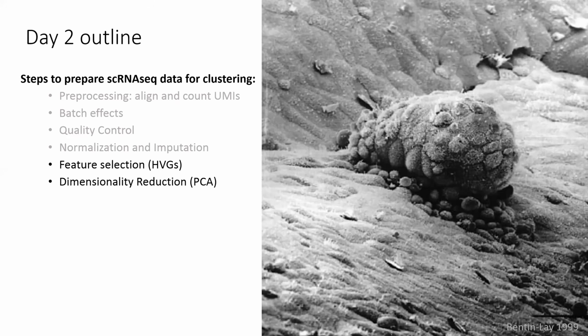Single-cell RNA-seq data has an extremely high dimensionality, meaning there are often tens of thousands of observations or cells that each have tens of thousands of variables or genes. And the high dimensionality and sparseness of the data can be problematic for clustering algorithms. So researchers are often motivated to reduce the dimensionality and remove axes of technical variation prior to cell type clustering.